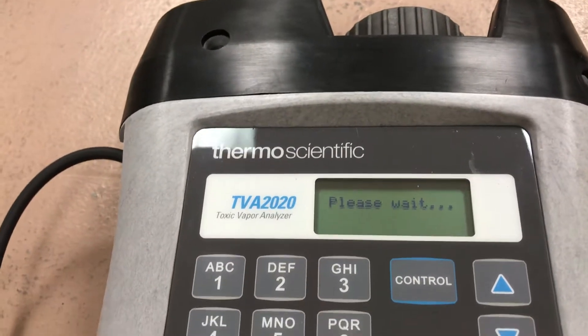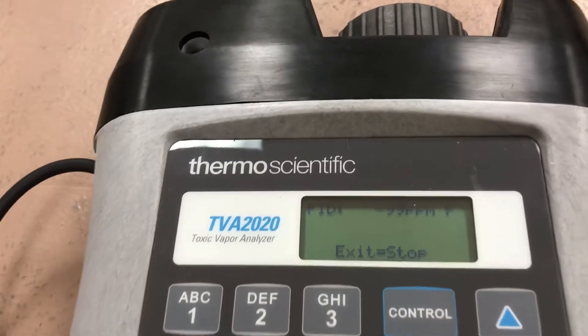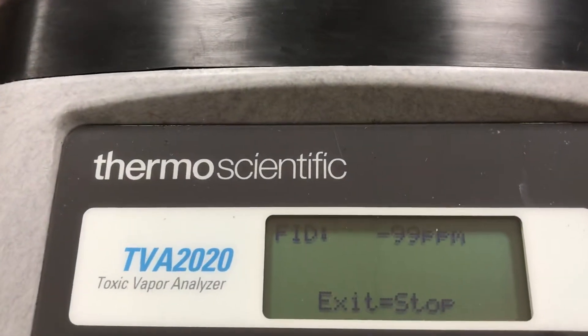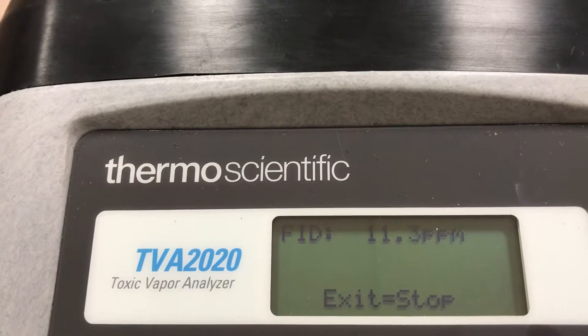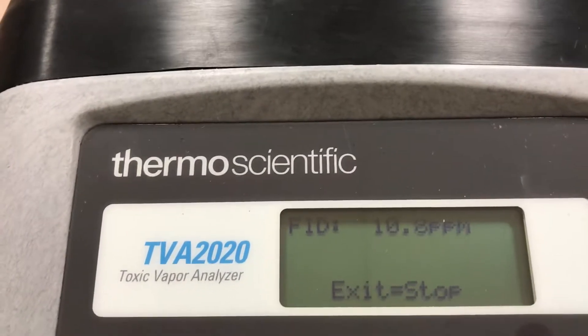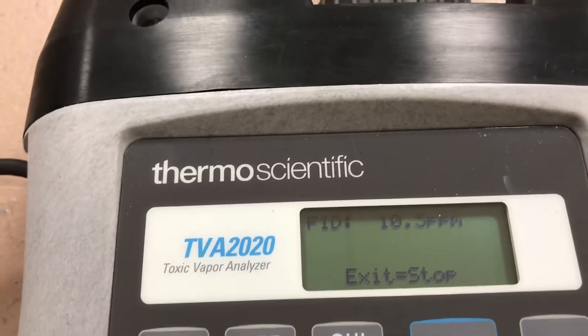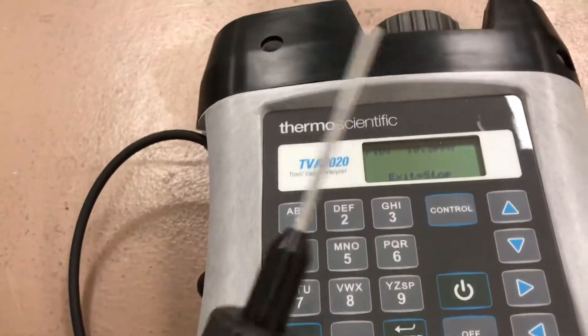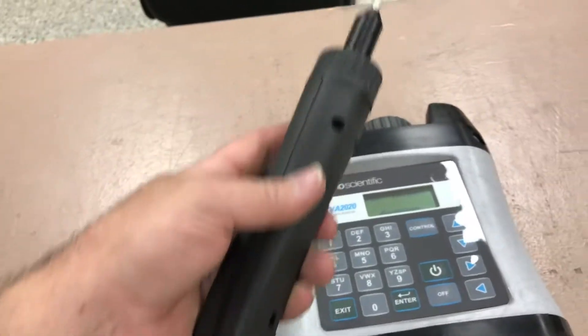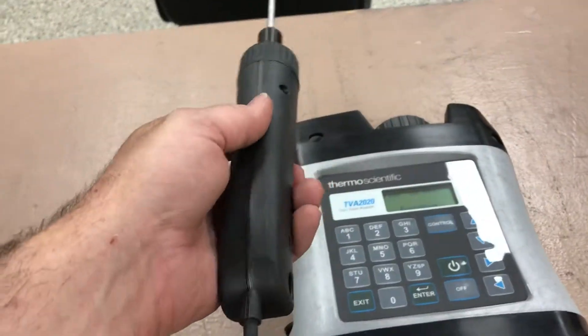It will say 'Please wait' and go through startup, then start the FID right away — it reads FID minus 99 initially. You know the flame is lit when you start to see readings. It's showing 11 ppm on this unit right now, so it's actively reading.